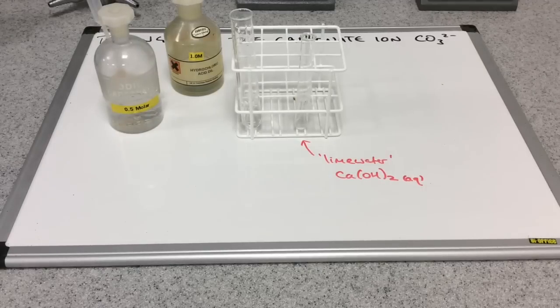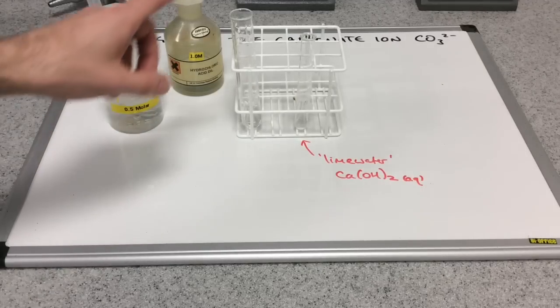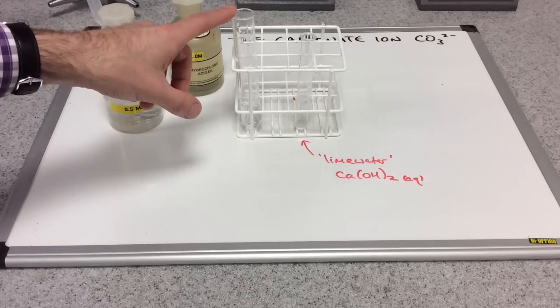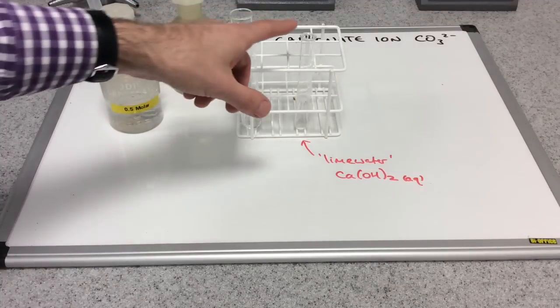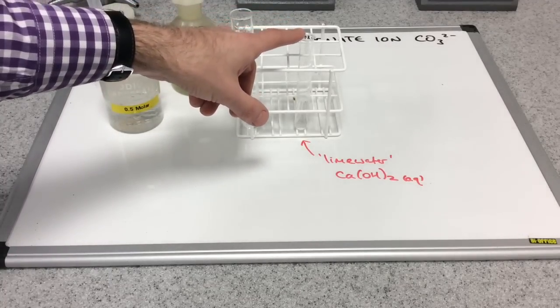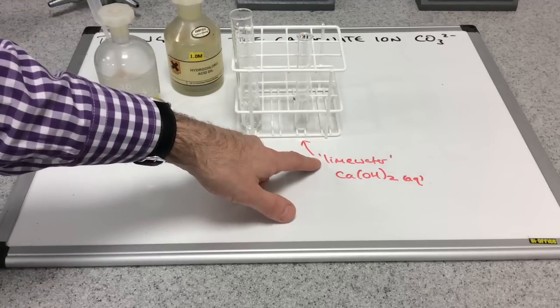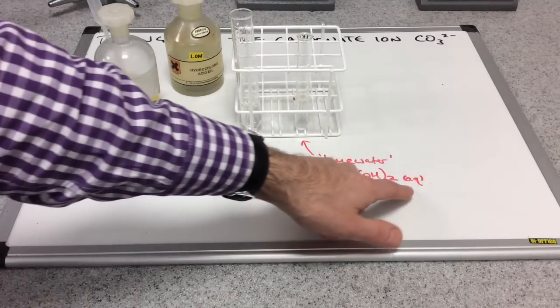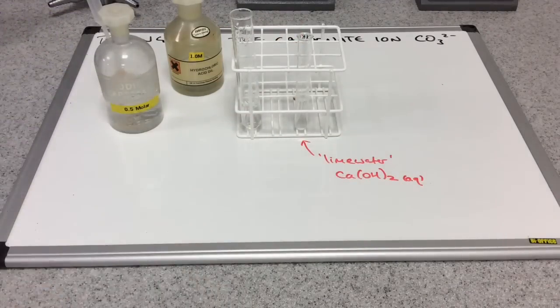I'm going to repeat the experiment now. But this time I'm going to send the gas that's produced, the carbon dioxide, from here into this smaller test tube here, which you can see I've written up contains lime water, which is the chemical aqueous calcium hydroxide.